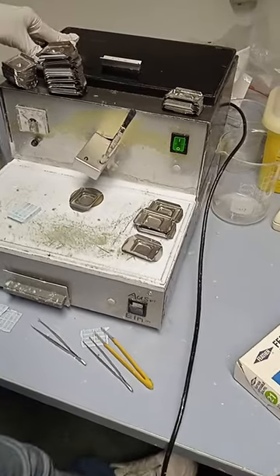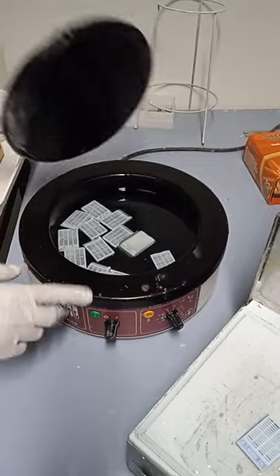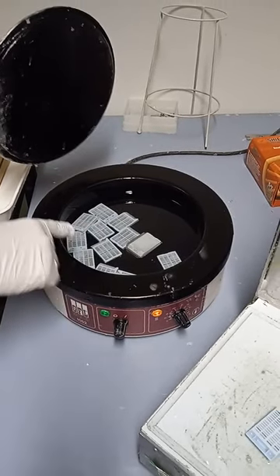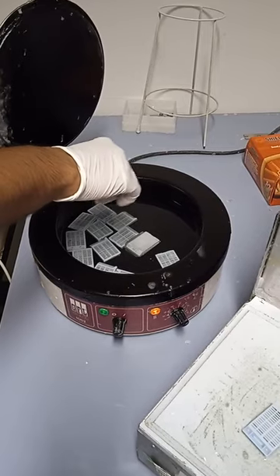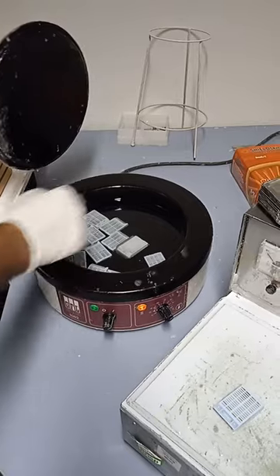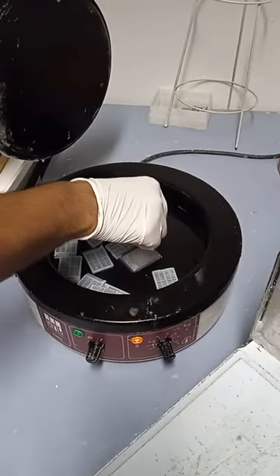Another machine that we need to use is this one. Here we already have liquid paraffin, and inside we have the tissues in the cassettes. To embed these sections, the first thing you need to do is take out the cassettes.